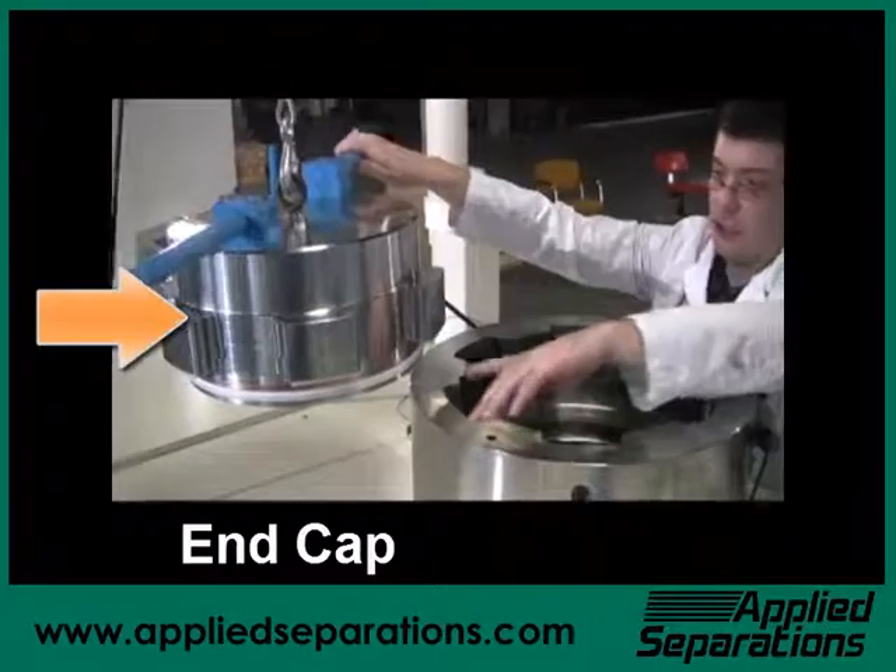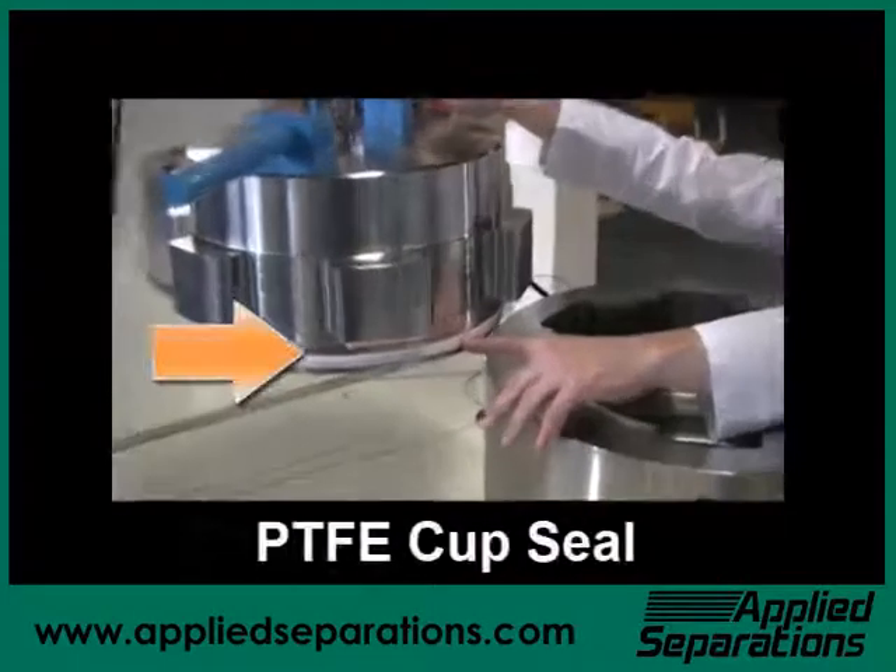The vessel end cap features a PTFE cup seal with a copper backing.